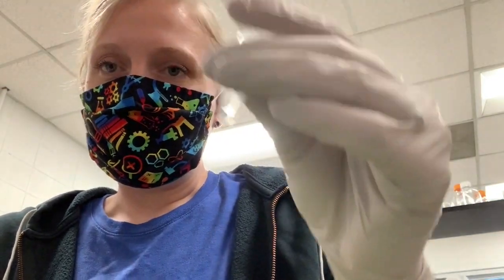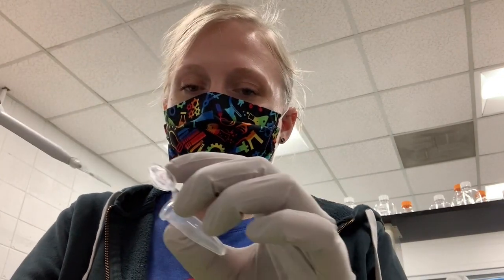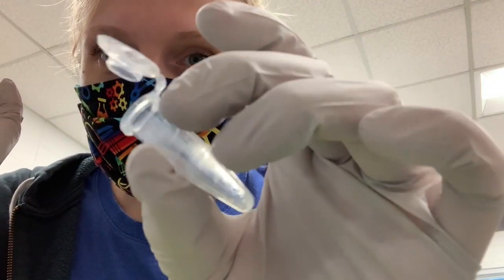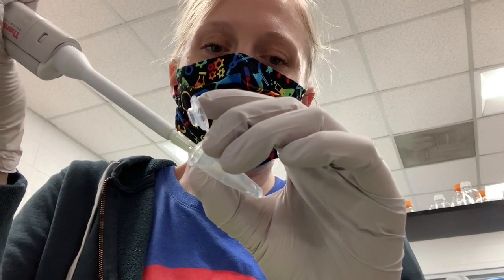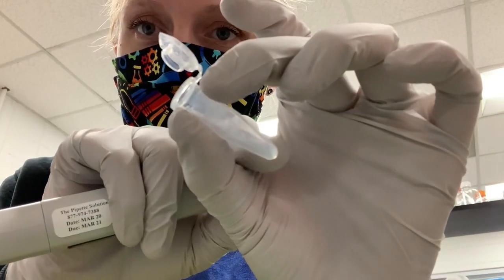Depending on how good of a job you did with removing the supernatant, you can often set a P10, a P20 that has a nice sharp tip to remove this supernatant. And it might take a couple of pipetting actions. So at the end you'll just have the glassy pellet at the bottom. If you did a little bit less well and you have a little bit more volume, you might, as I mentioned, use your P20. Again, you don't want to disturb your pellet or suck up your pellet, but you want to get all of this liquid out. So you can see that here.